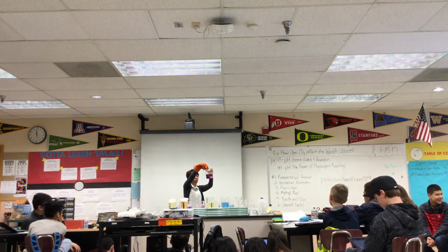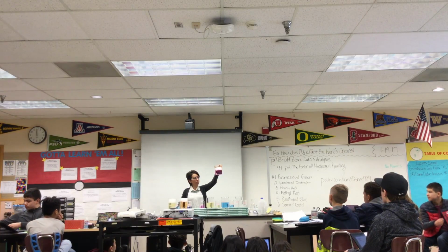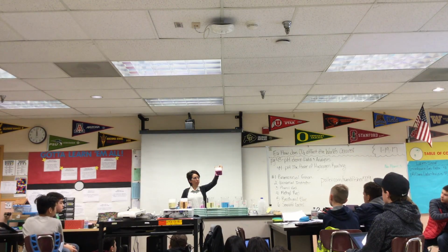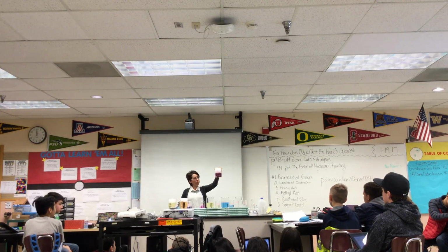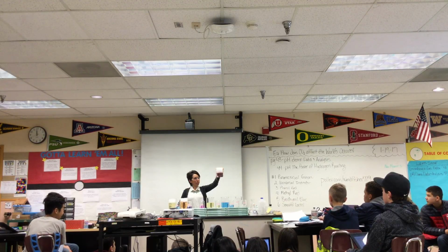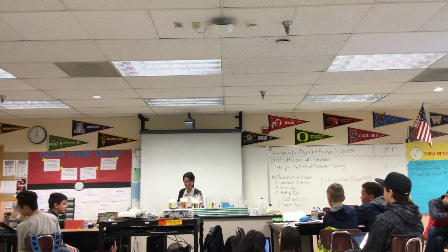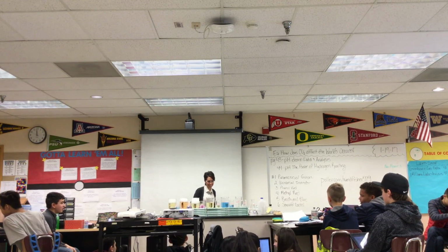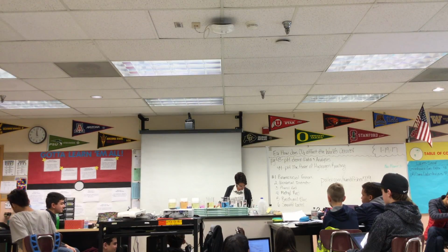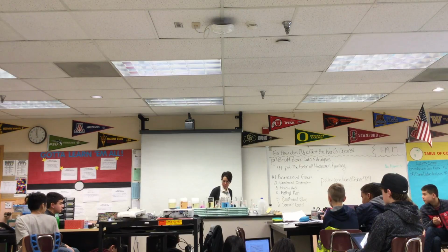Yellow. Here we go. Some of these start going pretty fast. Get ready. Oh, there we go. All right, so now we're yellow. It's so magical. All right. We'll test the final pH of that one in just a little bit.